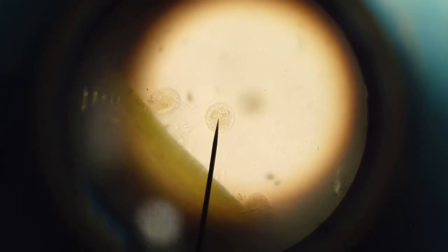And here's this one coming into focus. That's a Vorticella. You can make out the spiral on the lower one, just barely.